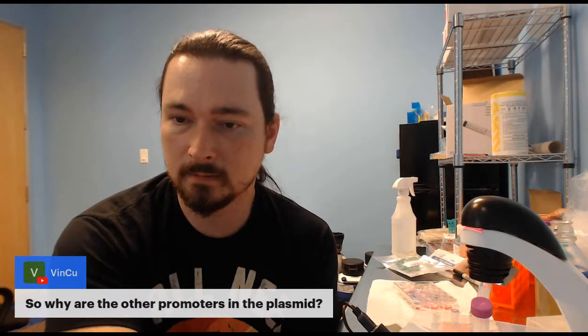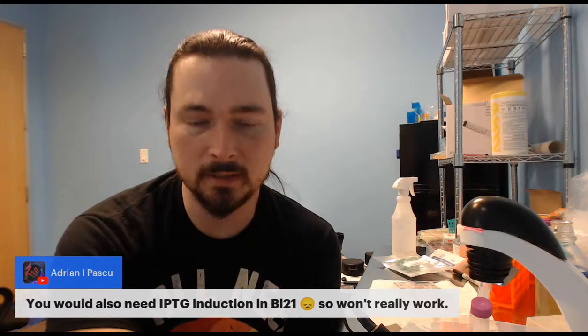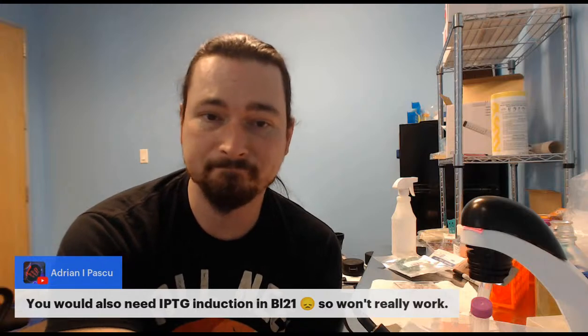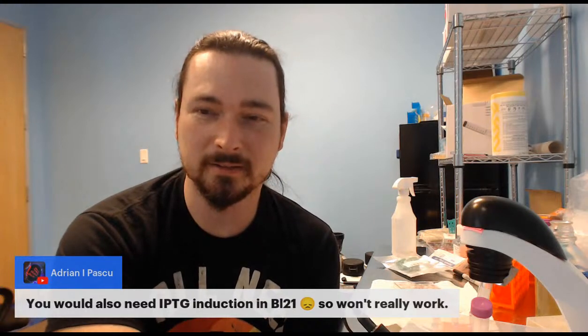Let's see. Yeah, I thought you might need IPTG induction with BL21. But you can always add IPTG. That's not really a big problem. Just add it to the plate. But even then, without a good terminator, I don't know.